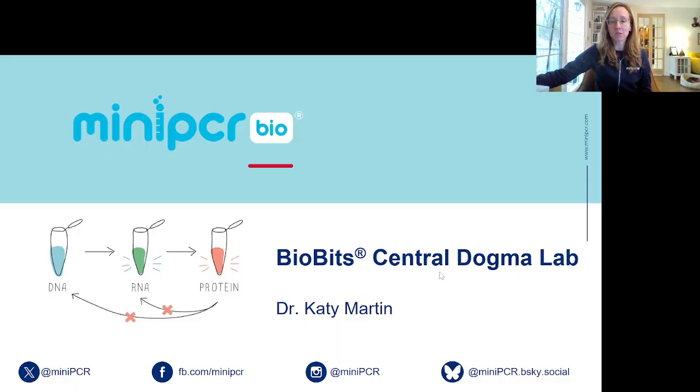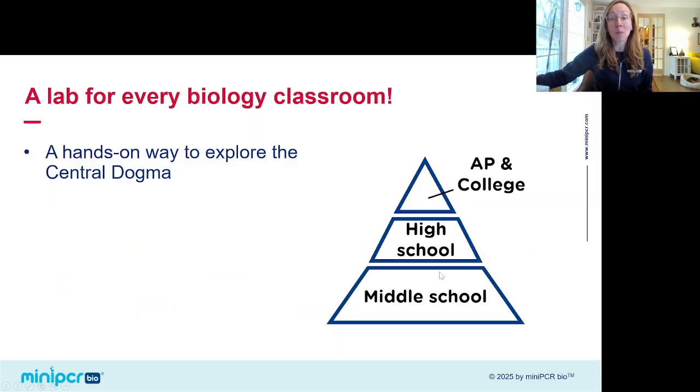The BioBits Central Dogma Lab is one of our most popular learning labs. It's a hands-on way to explore the central dogma, a curriculum area that's usually hard to supplement with scientific experimentation.